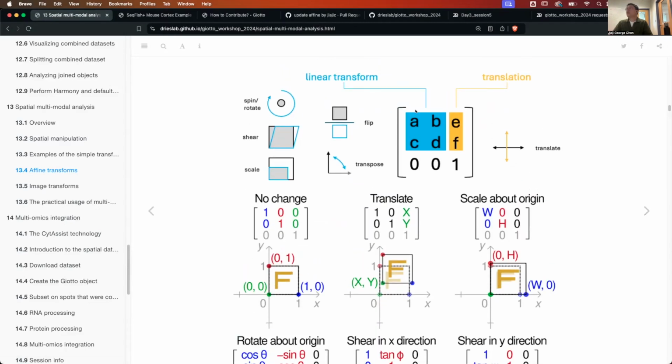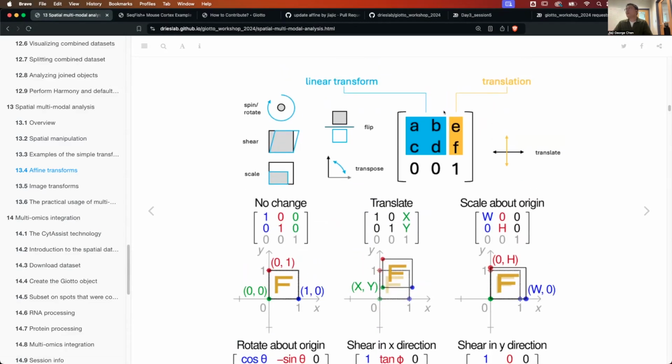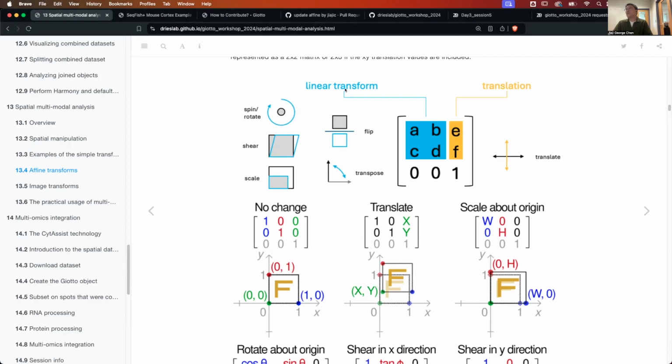So the overall anatomy of an affine transform matrix is this over here. You have either just this 2x3 area, or you can have the entire 3 by 3, except these values down here are not used so much. The linear transform section is the part that tells how your coordinate plane should behave. Should it entirely shear over? Should it be, you can do a flip over here.